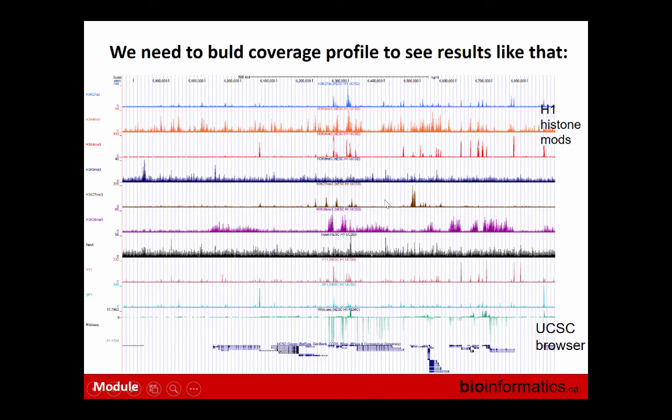Now the brown one is H3K27me3. You probably heard that those are extended marks, so broad marks. And in most differentiated cells, that's what you will see: a rather broad mark domain. Often it has a shape like that: a peak which has a neighboring broad domain. It's a very, very frequent situation. But in embryonic stem cells, H3K27me3 actually looks like a very compact mark. Maybe it's the data we chose to go with, but the look of the H3K27me3 repressive mark is different from what you would normally see in other data sets. Just wanted to mention this.